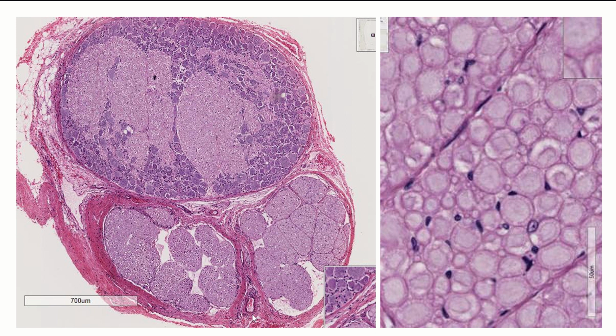You would see some blood vessels, right? Because blood vessels are in connective tissue. And you can see here, all this connective tissue surrounding the entire nerve would be our epineurium. Epineurium meaning outermost, right? And then within here, we've got bundles. So here's one big bundle, one big bundle, one big bundle, and we've got some other smaller bundles within that, right? So surrounding any of these bundles, this would all be perineurium, okay?